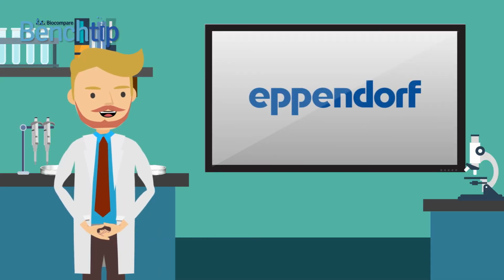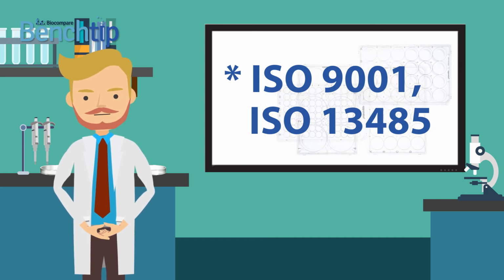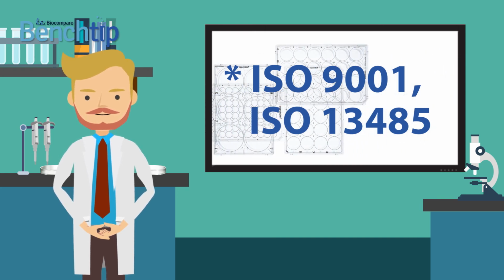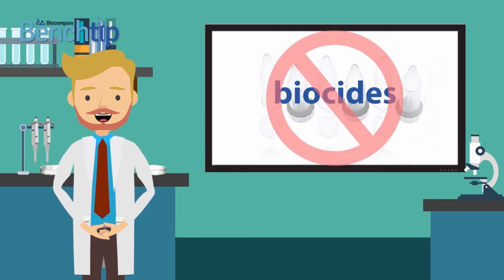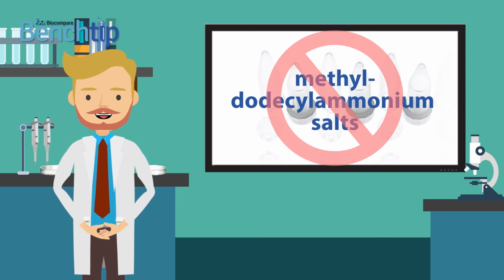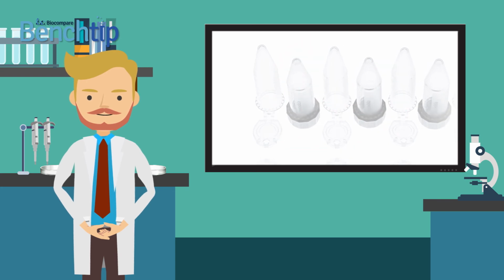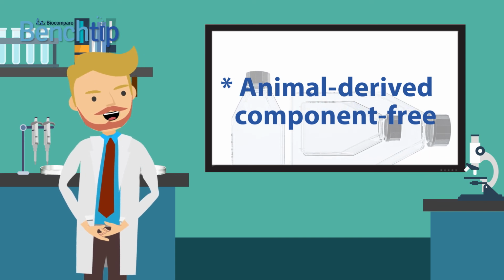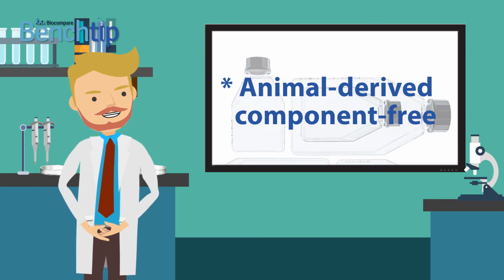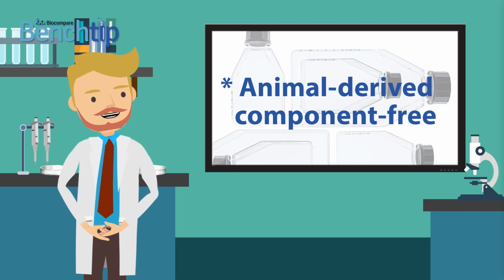Some companies, like Eppendorf, ensure their disposable labware is produced from virgin polypropylene, polyethylene, polycarbonate, polystyrene, or UV transparent plastic. These companies never use recycled plastics, nor do they employ slip agents, biocides, methyl dodecylammonium salts, plasticizers, melamine, silicone, or latex. It is also important to only use materials from suppliers who guarantee that animal-derived components, when they are used, are sourced from countries that have not been affected with bovine spongiform encephalopathy.